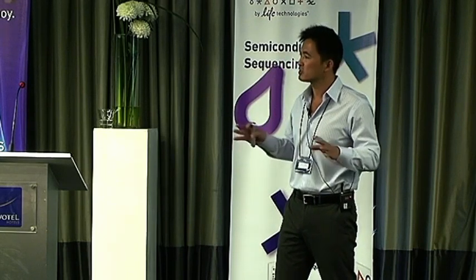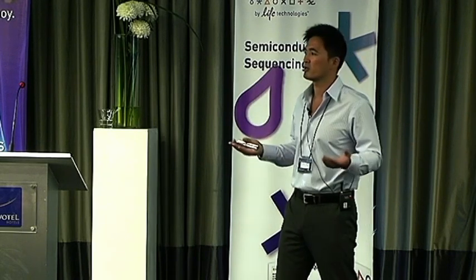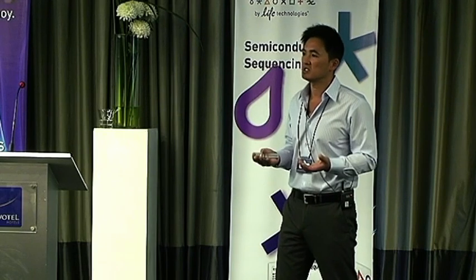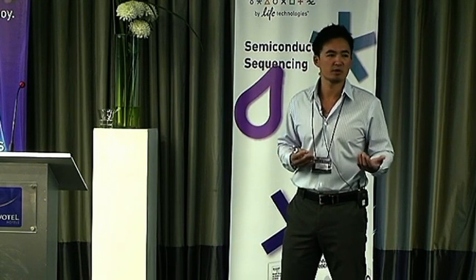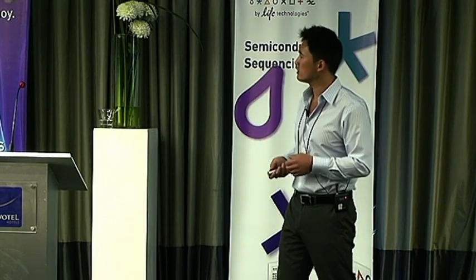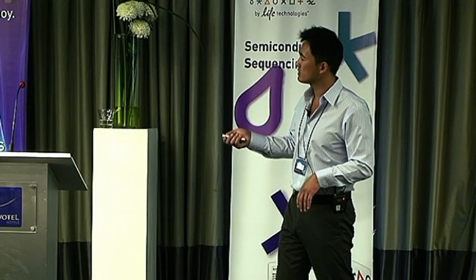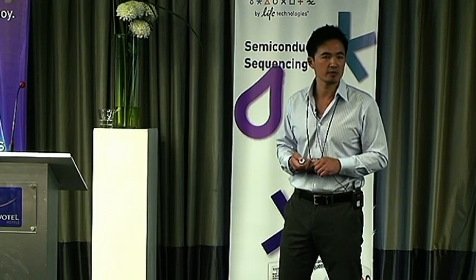That's no big deal, because remember, the CT value itself is an arbitrary number. There's no meaning in that CT value unless you compare it relatively to another reference sample or a reference marker. So everything is shifted dramatically. What we do here is demonstrate that, yes, even with the OpenArray, we're able to achieve a very good dynamic range.